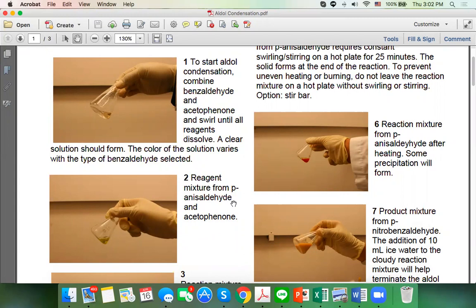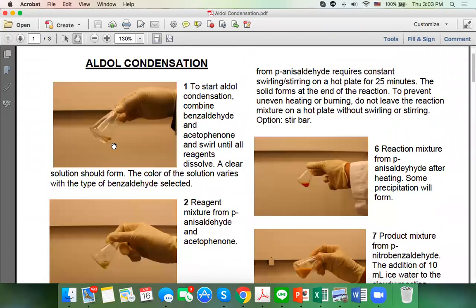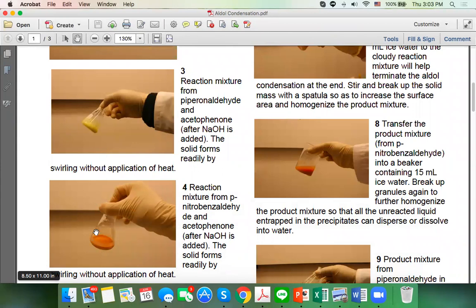Okay, and so depending on the type of the benzaldehyde you choose, you can, my goodness, in the first 5 minutes, you'll be able to see this change from a solution, okay, to this, like pineapple paste, yeah, and to this. Now this brick color, the brick color solution is actually coming from the nitro substituents on the benzaldehyde, okay? Yeah, in the first 5 minutes we'll see this, okay?